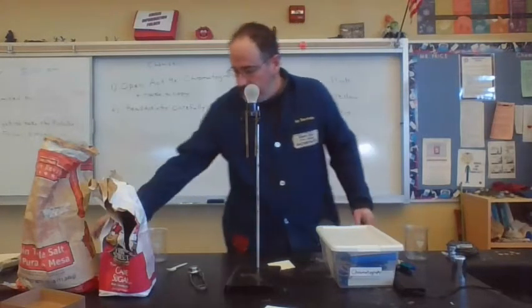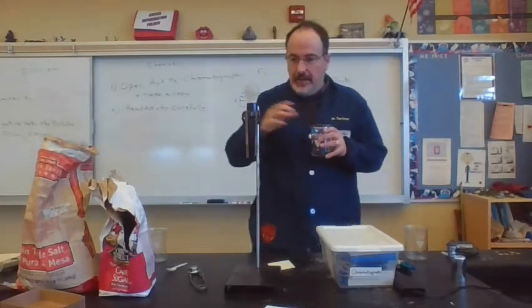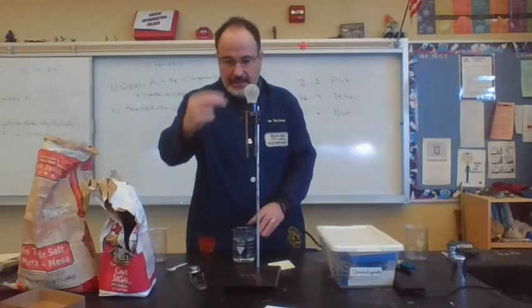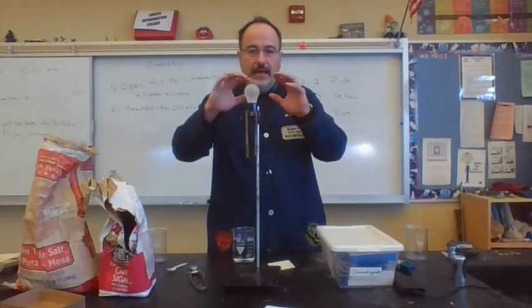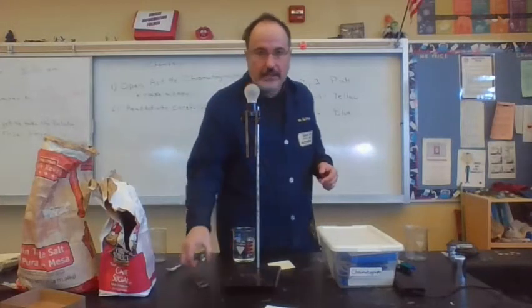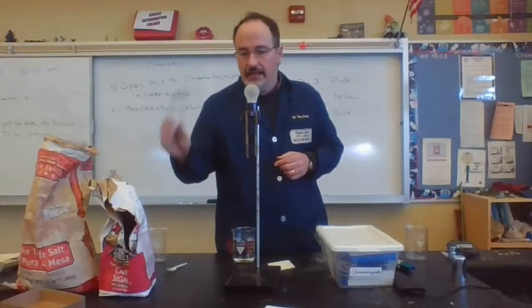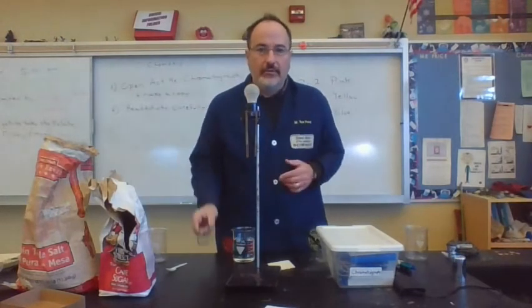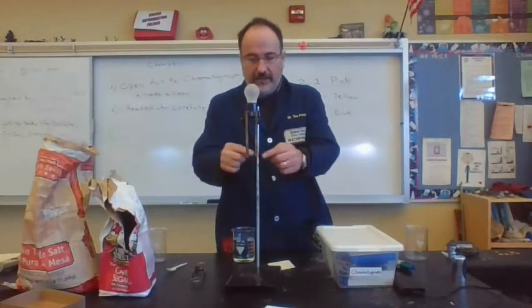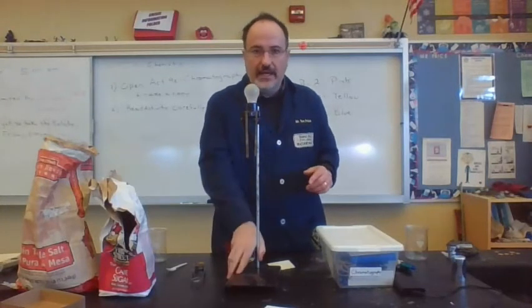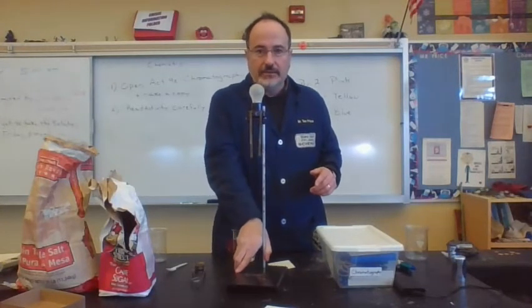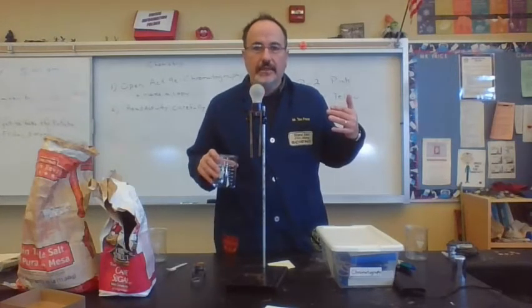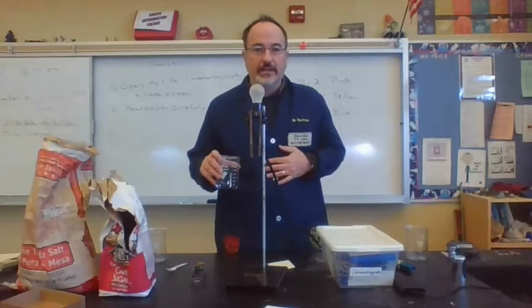Well, what I have here is some water, and I have a conductivity tester. Now, basically, this is simply a light bulb with two electrodes, and when I connect and complete the circuit — like with this metal right here — the light bulb will go on. So if anything can conduct electricity between these two electrodes, then it means that the substance will conduct electricity.